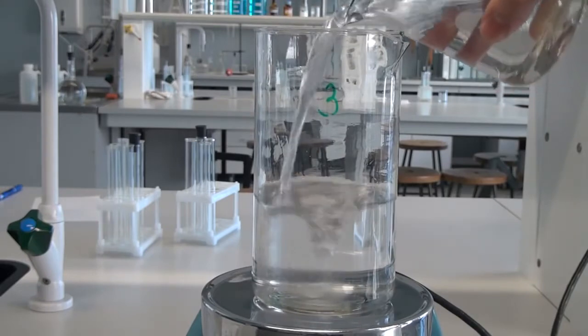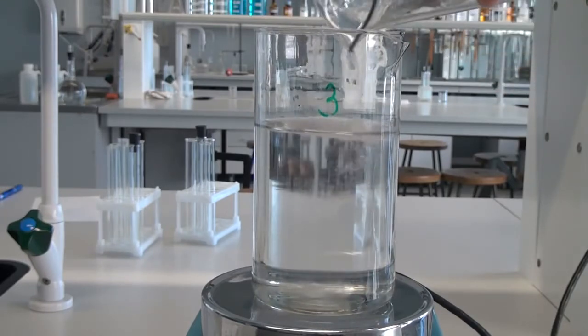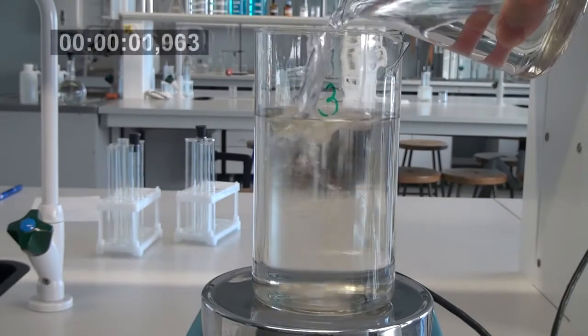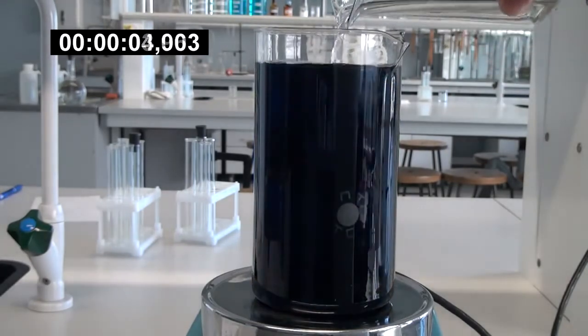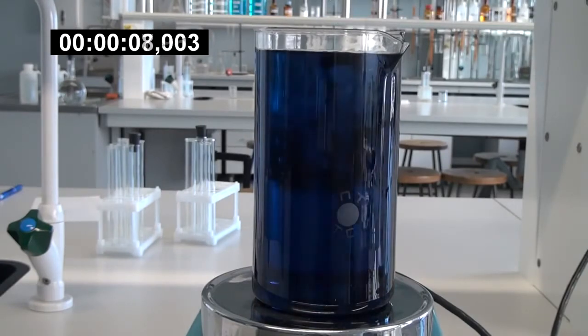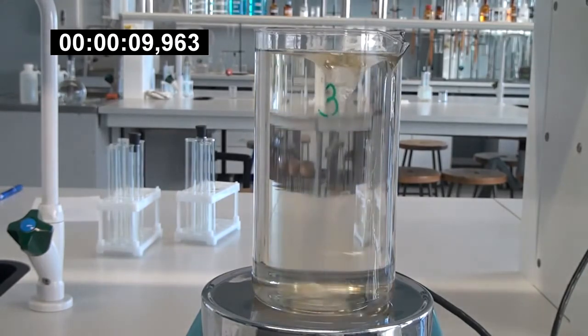Next, the second solution is poured into the third solution, and finally the first solution is added. Thereafter, the reaction begins. The solution first turns yellow and then becomes dark blue. After that, the solution is decolorized and the cycle repeats.